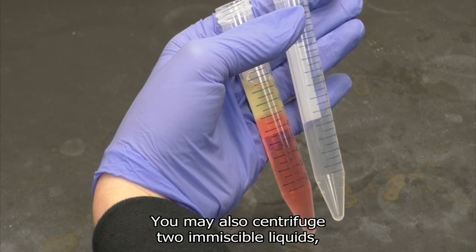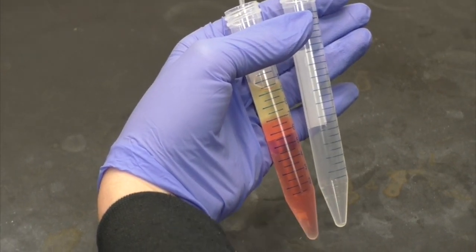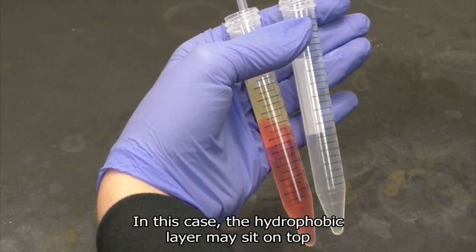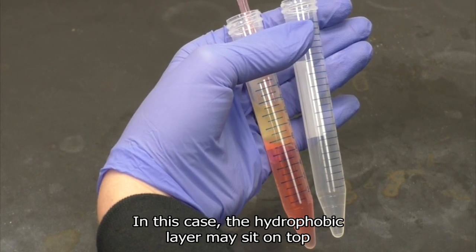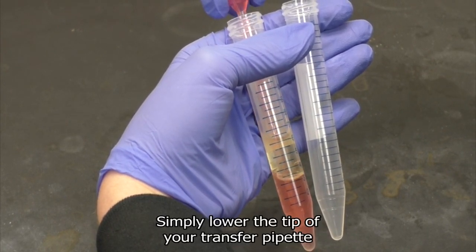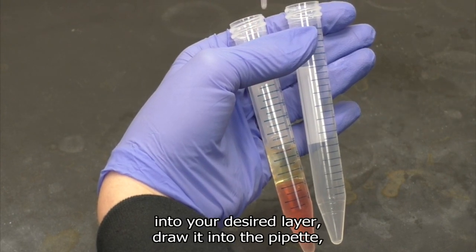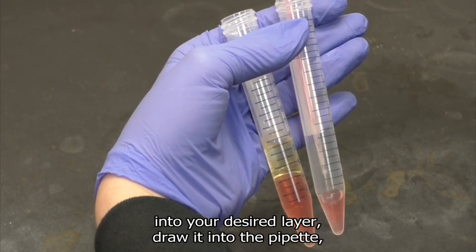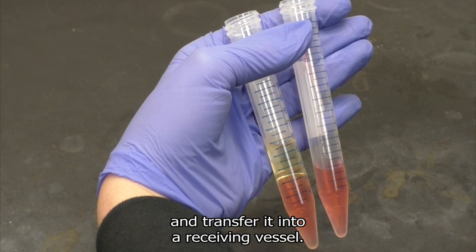You may also centrifuge two immiscible liquids such as oil and water. In this case, the hydrophobic layer may sit on top of your desired liquid. Simply lower the tip of your transfer pipette into your desired layer, draw it into the pipette, and transfer it into a receiving vessel.